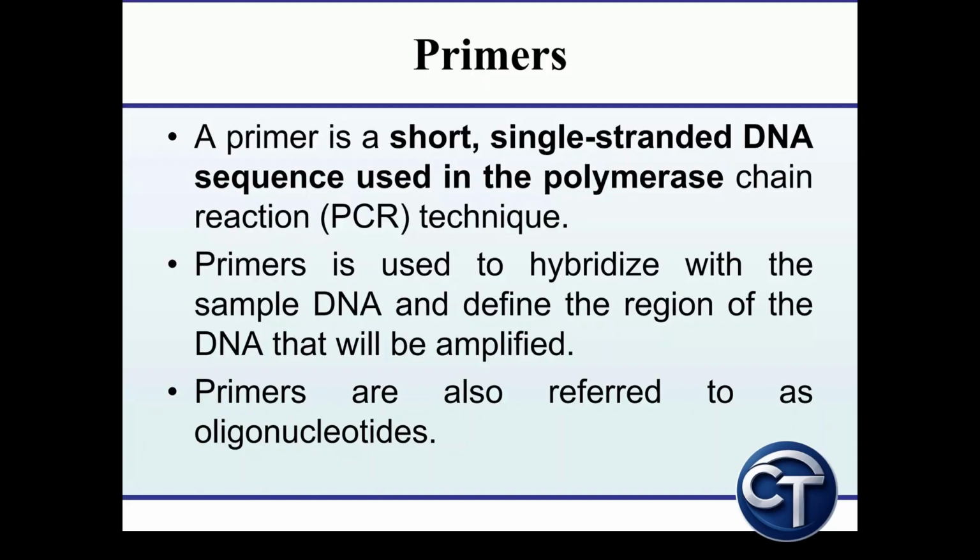In molecular biology, most techniques such as PCR, sequencing, and cloning rely on DNA amplification. This amplification cannot occur without primers. Primers are short oligonucleotide sequences that bind to a specific DNA region and provide a free 3' hydroxyl group for DNA polymerase to initiate synthesis. So let me draw it for you. Here we have a DNA strand. This is the 3' end, this is the 5' end, and our primer should bind here. For the primer, the 5' end is here and the 3' end is here. Here it will provide a hydroxyl group for the polymerase to start the process of polymerization.